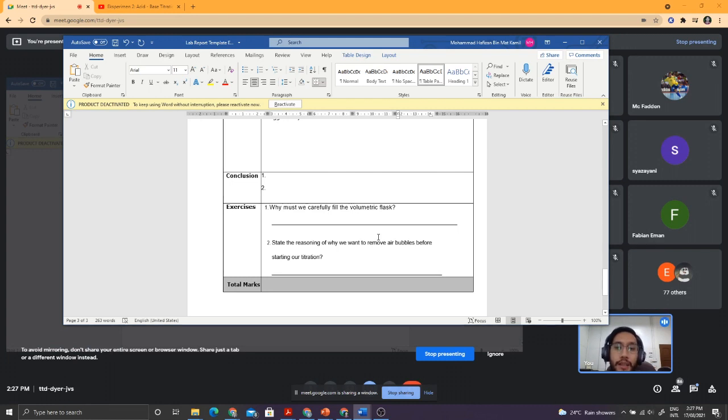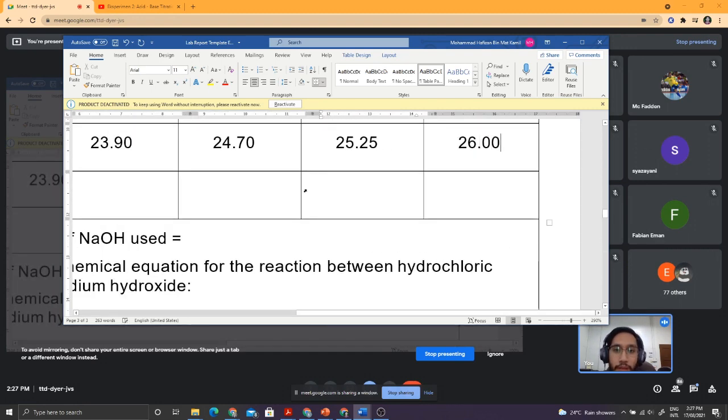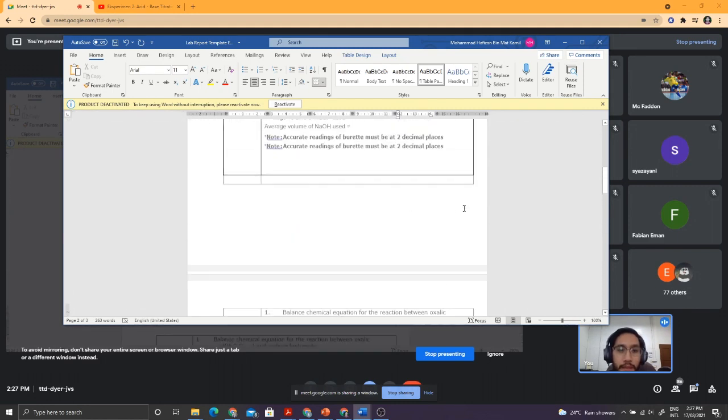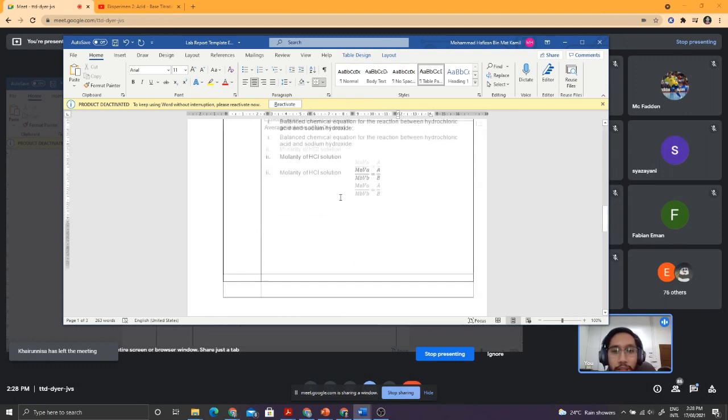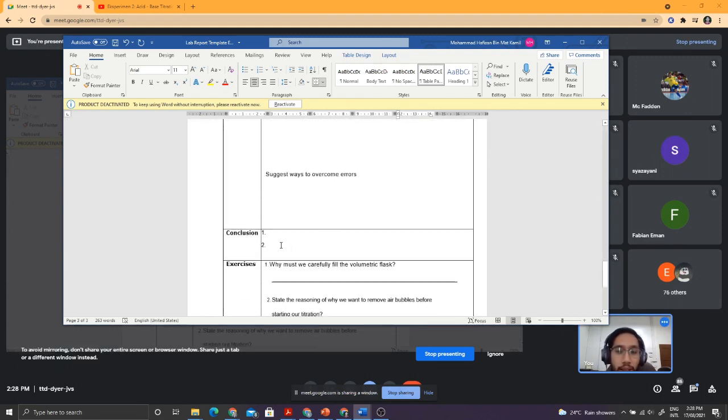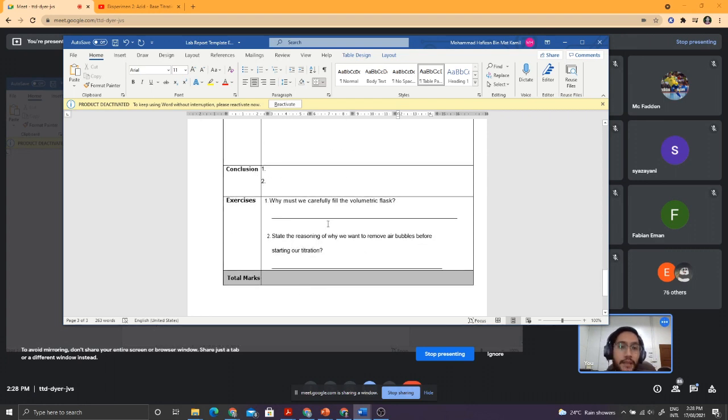chemical reaction punya formula, which is the full yang last kali lah, and then you can tulis, because our experiment dia nak determination of the concentration of HCl. So you boleh bagi tahu lah from the experiment you dapat apa concentration of the HCl. So then exercise ada 2, and then you should be fine. And macam biasa, you are given 1 week and hantar Isnin depan lah.